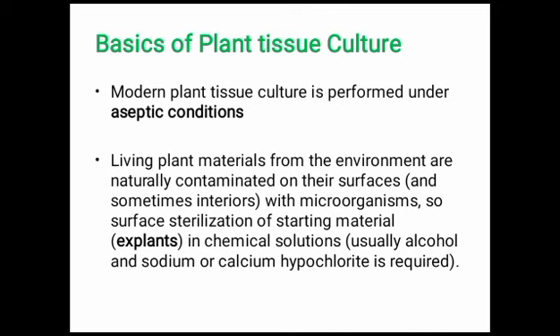These aseptic conditions are totally controlled, meaning the specific temperature, specific environmental and climatic conditions are controlled. Living plant material from the environment is naturally contaminated on its surface with microorganisms. So surface sterilization of the starting material, the explants, in a chemical solution, usually alcohol and sodium or calcium hypochlorite, is required.